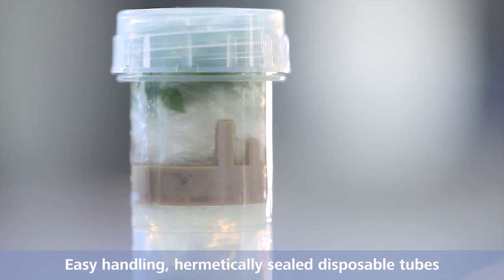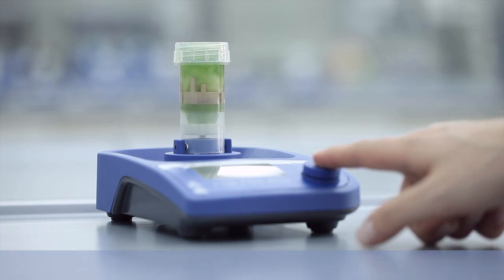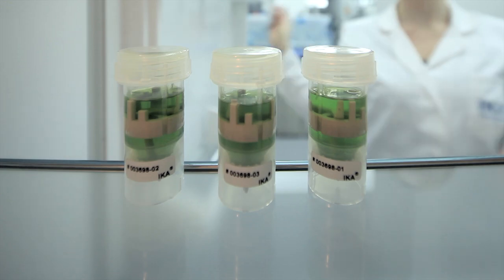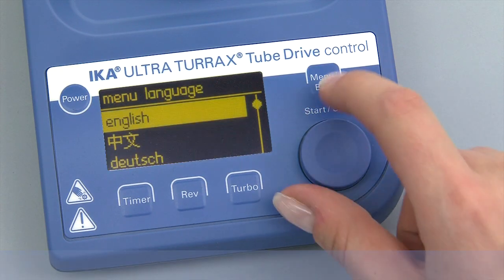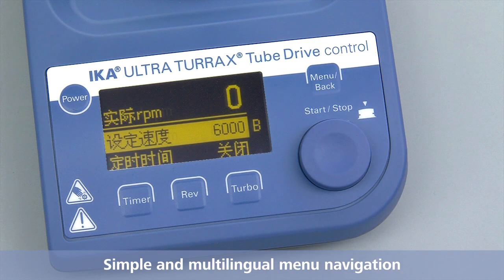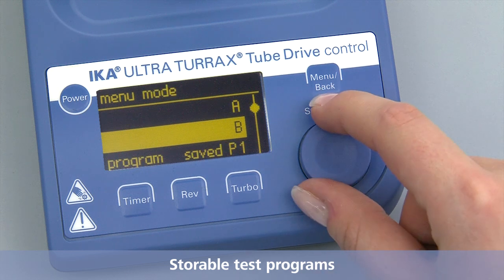Easy handling of the hermetically sealed disposable tubes. Easy to read OLED display. Simple and multilingual menu navigation. Storable test programs.